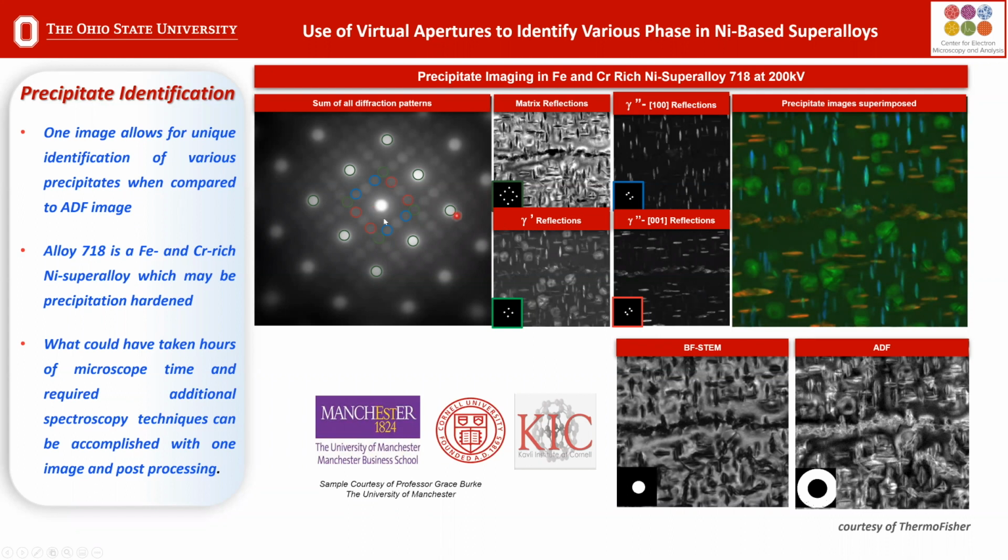Just how we've used this image here to create these various reflections, we can use this image to put an HADF around it, or an ADF, an annular dark field, which is down here in this corner. When we do that, as I've said before, the annular dark field image, or this HADF image, is proportional to Z squared, the atomic number.